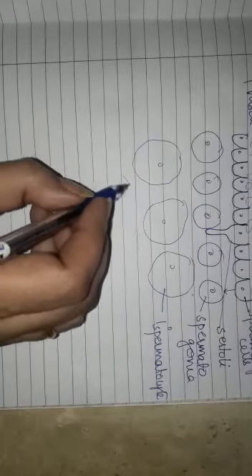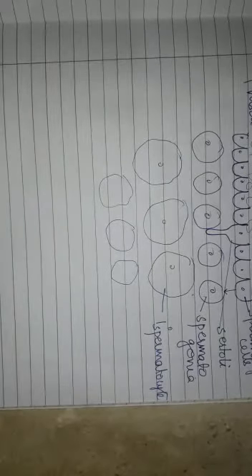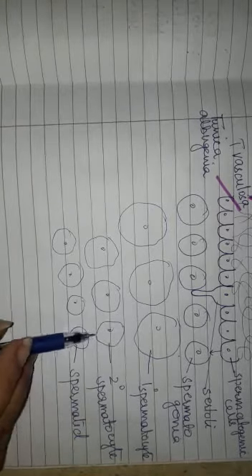These primary spermatocyte undergo meiosis and produce the secondary spermatocyte. After first meiotic division and after second meiotic division, they will produce spermatids.